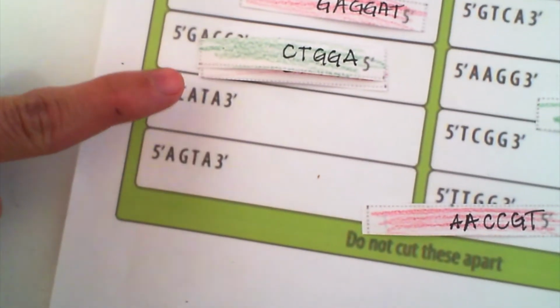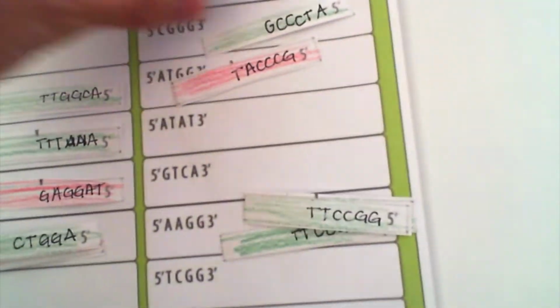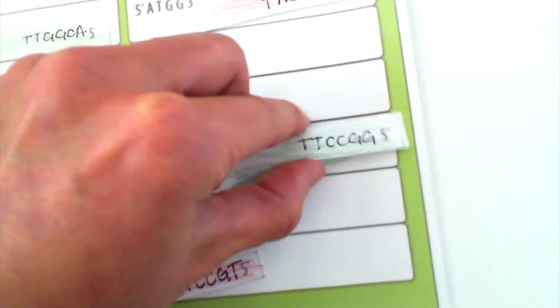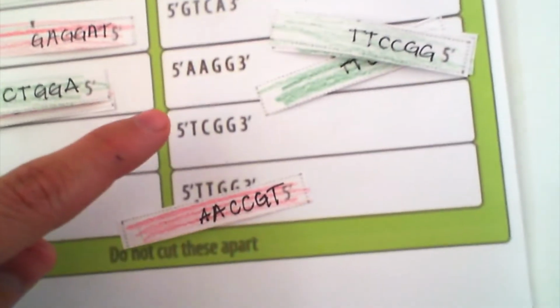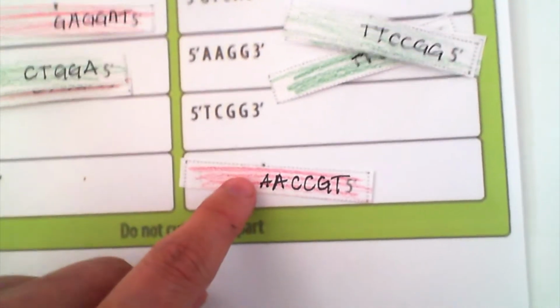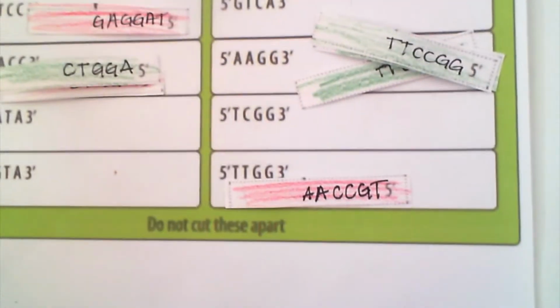And then this one, we have that one. This one, remember, it had 3 greens. And then this one has nothing. And then this one has the red cDNA.